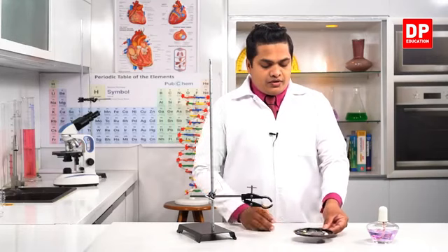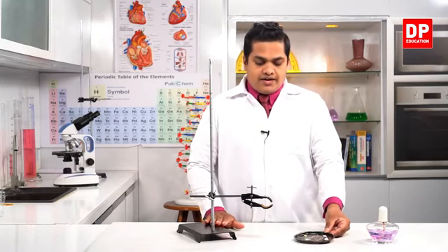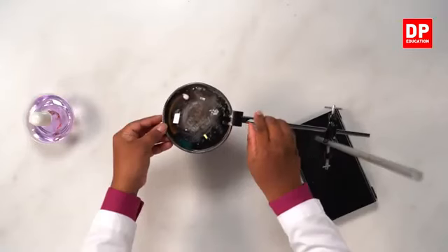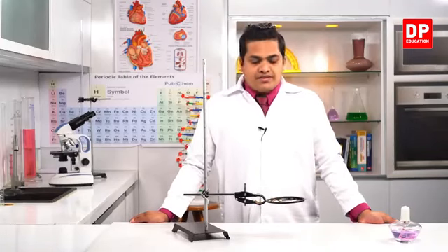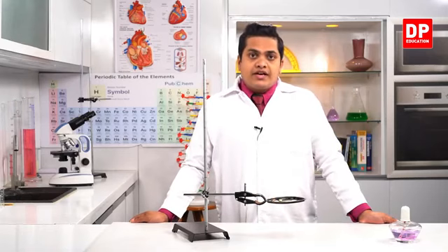So now I'm going to fix this metal plate containing these substances on the stand, like this. Right, children, now let's heat up this system and observe which material will ignite first and which material will ignite last.